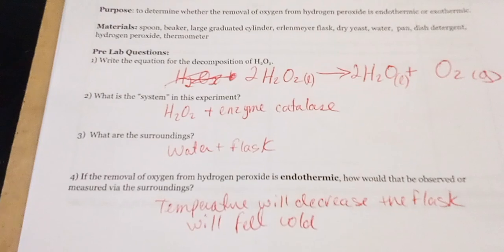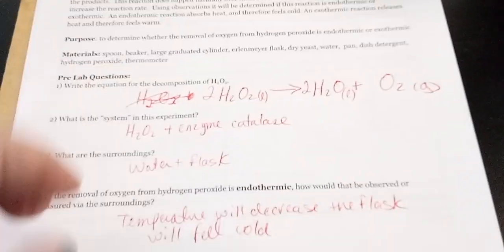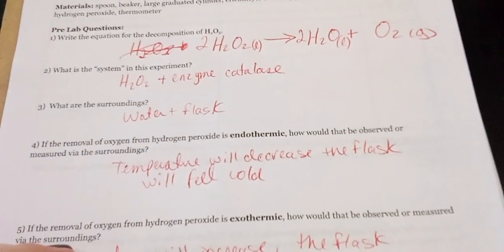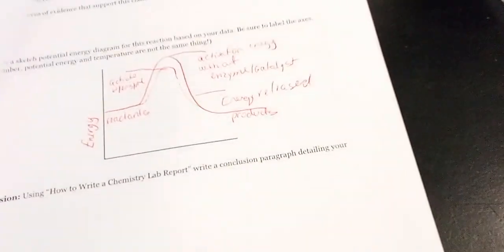There we go. If the removal of oxygen from hydrogen peroxide is endothermic, what will be observed? We already have the answer from there. If it's endothermic, the temperature will probably decrease and the flask will feel cold. If it's exothermic, the temperature will increase and the flask will feel hot. I already got the yeast in here, sitting here for a while. I'm going to measure some hydrogen peroxide and I'm going to take the temperature. So I will set up the phone over here.